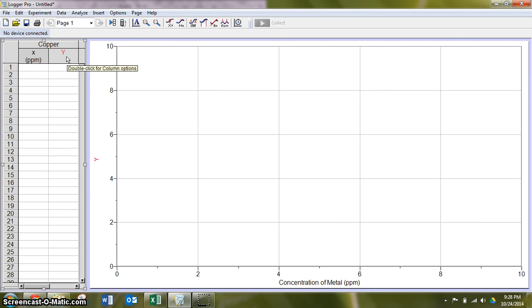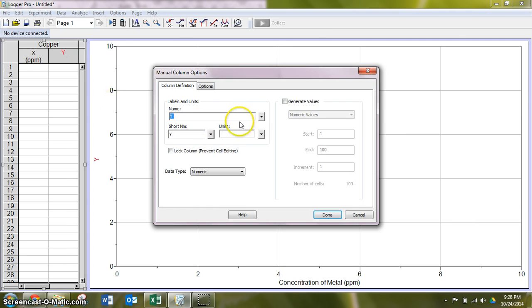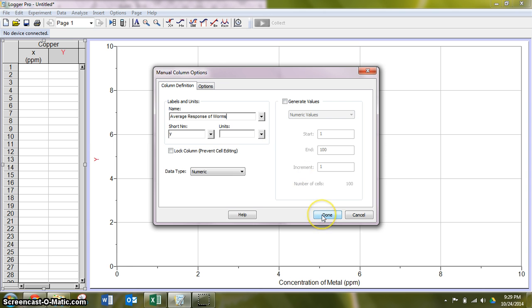This time however, when I double click and label, my y-axis is not going to be how many worms responded, but the average response of worms based on our converting the response to a numerical value.